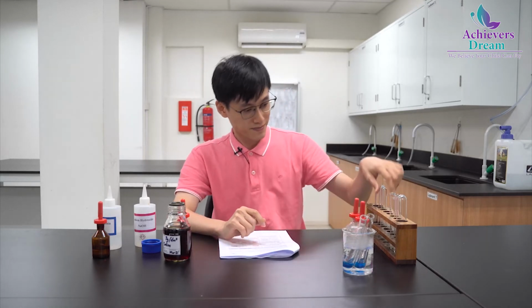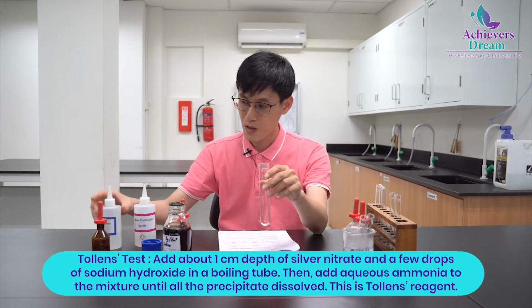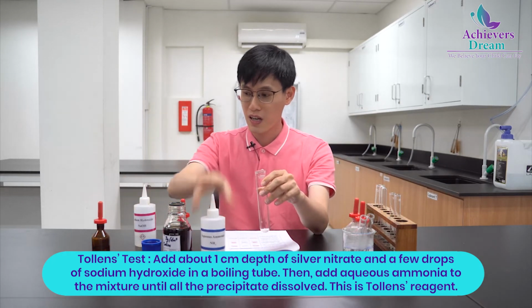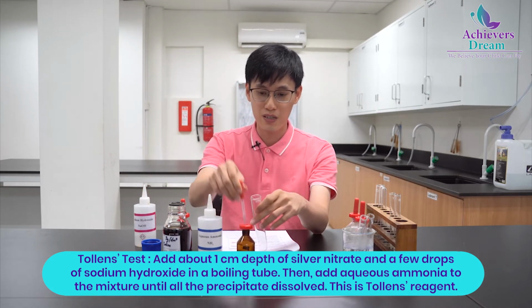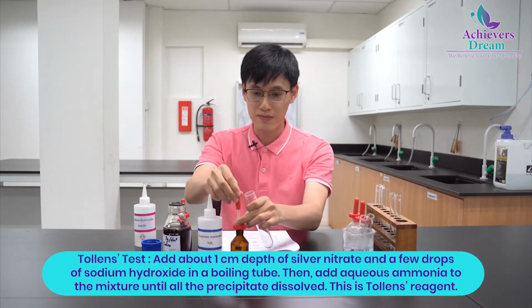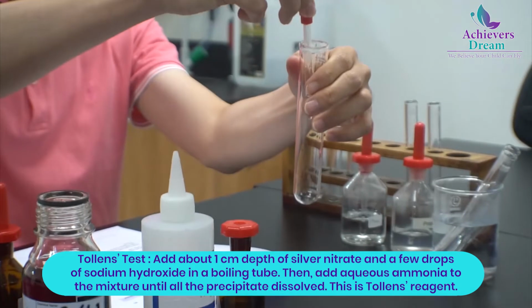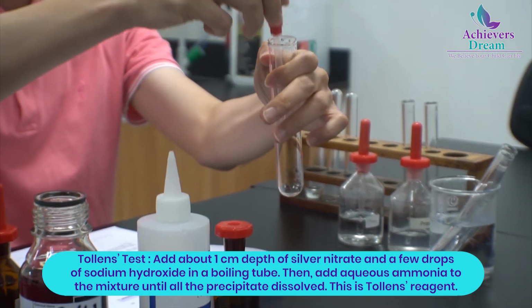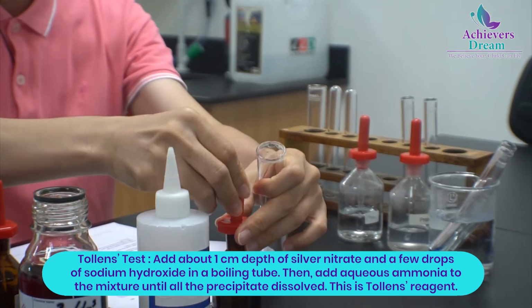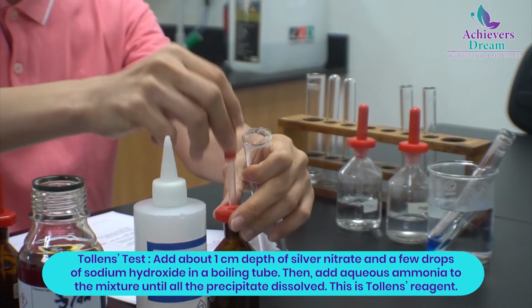Now we will do the Tollens' test. So what I have is a boiling tube which I will be adding silver nitrate to, about 1 cm depth. After that, we will be adding sodium hydroxide to the silver nitrate.